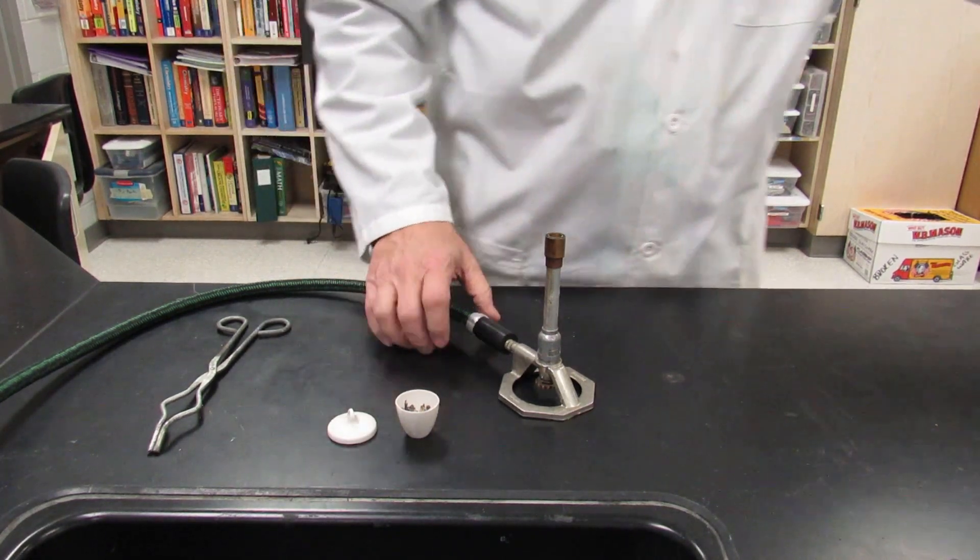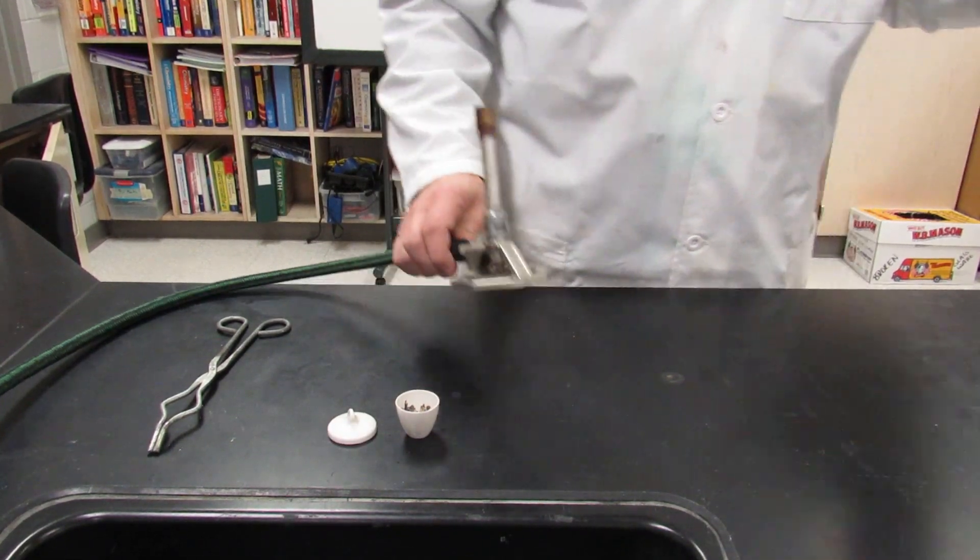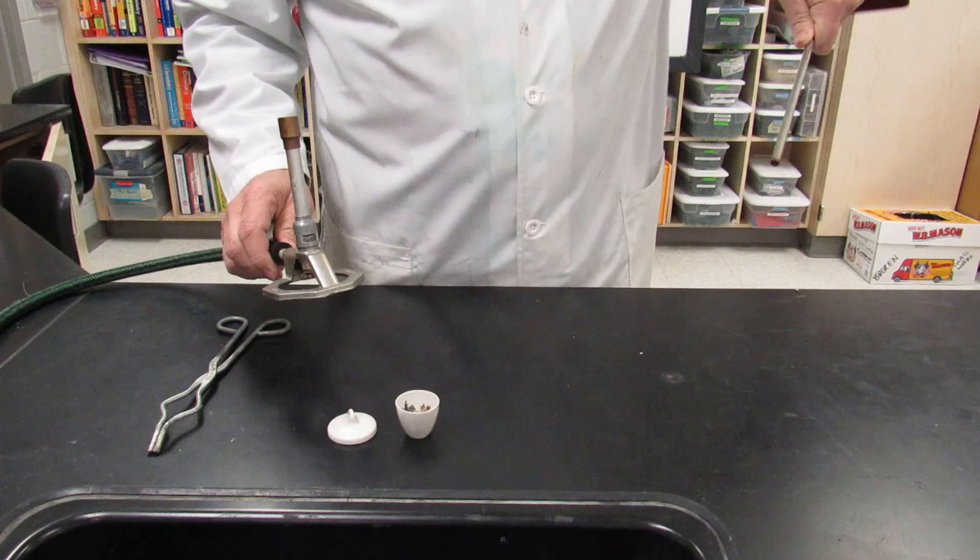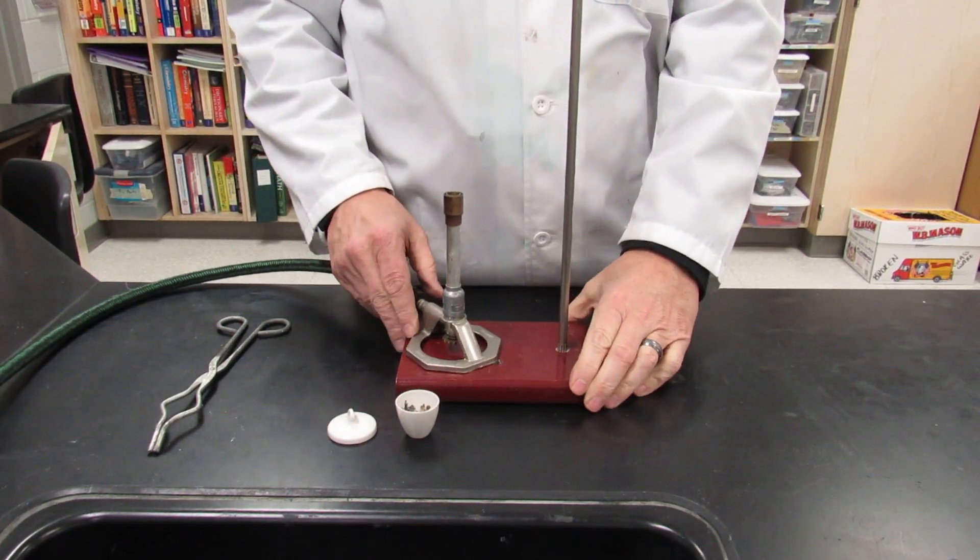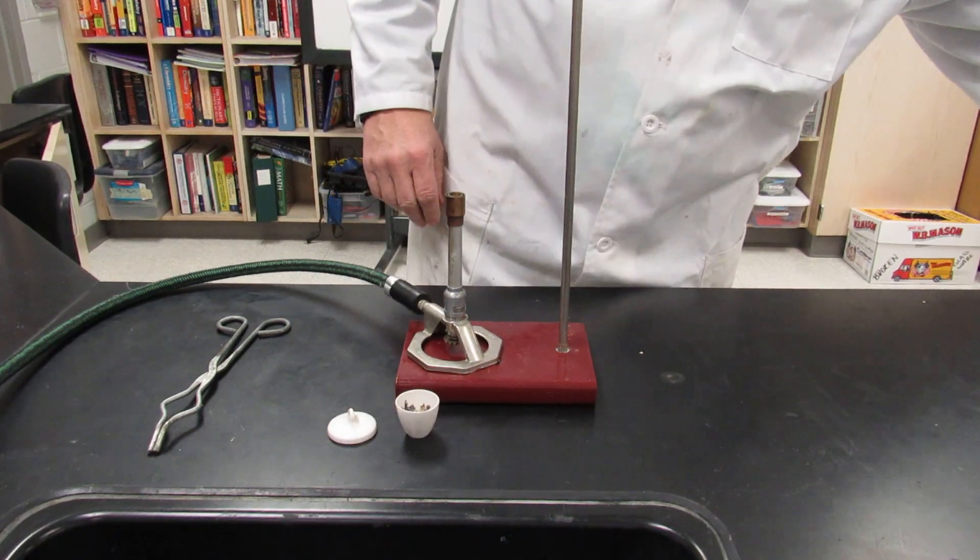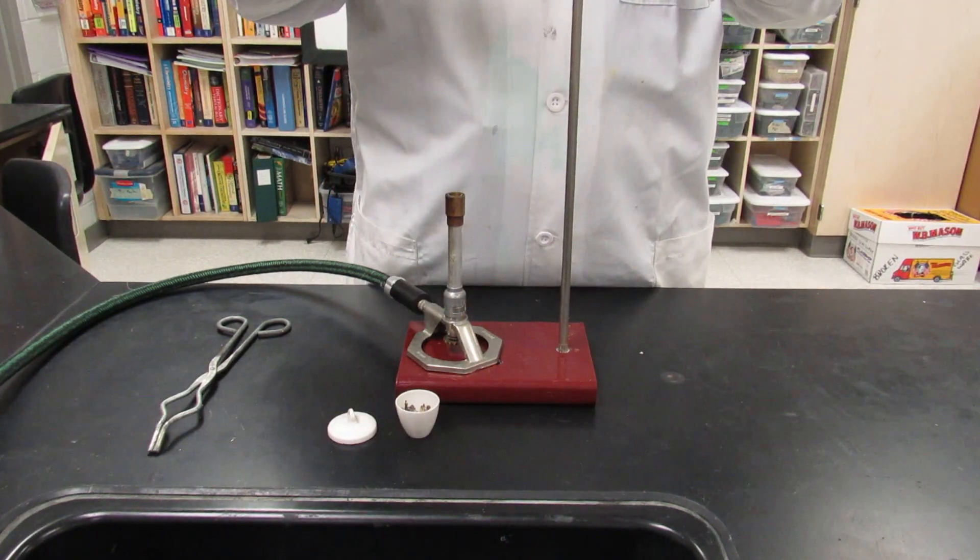Here's the setup. You're going to take your ring stand, set your Bunsen burner on your ring stand, attach your iron ring.